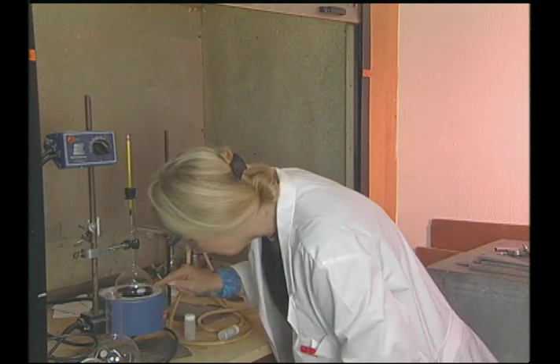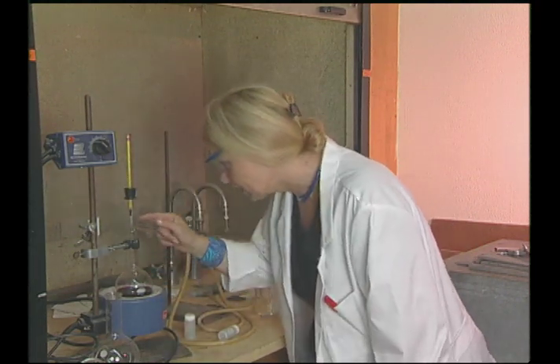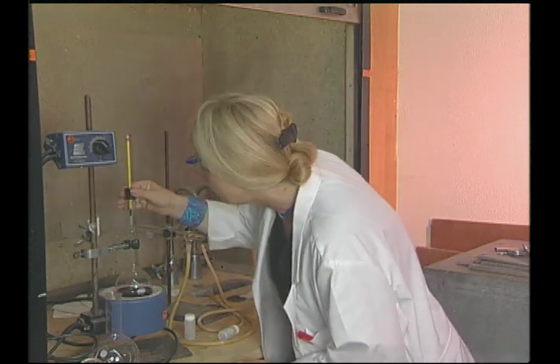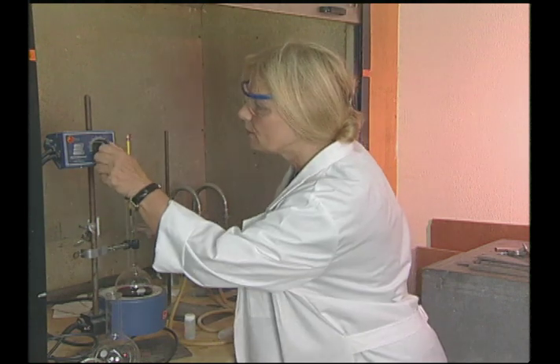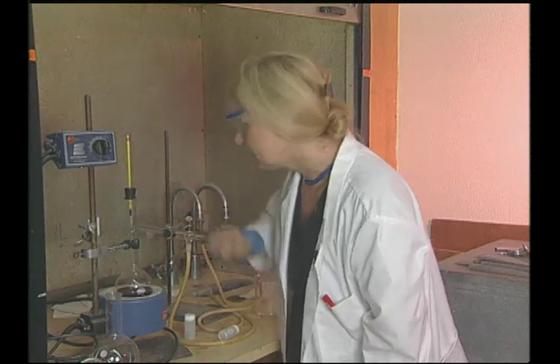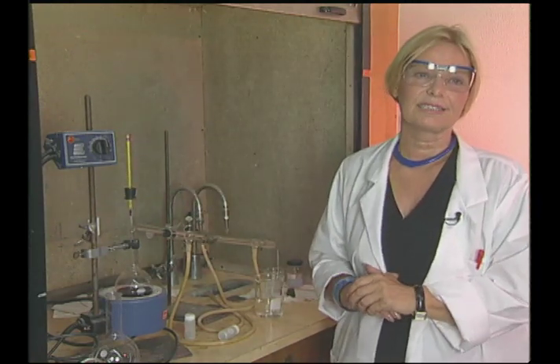We have to make sure, yeah, see, I can see already the condensation building up. So we're getting ready to roll. The temperature went down a little bit, so maybe I should heat it up a bit more. And then once it is 100 degrees, we'll check on this apparatus again.